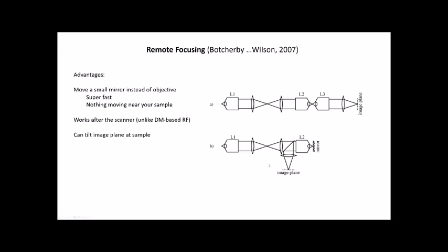Okay, so this microscope is sophisticated. It's got a lot of different components, and I want this to be a discussion, so hopefully I can engage with you folks. If you're not feeling it, no worries. But one thing that we need to do with this microscope is scan in 3 dimensions very quickly, because synapses are distributed in 3 dimensions.